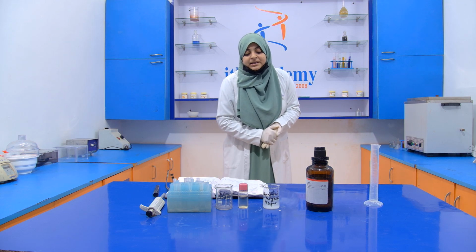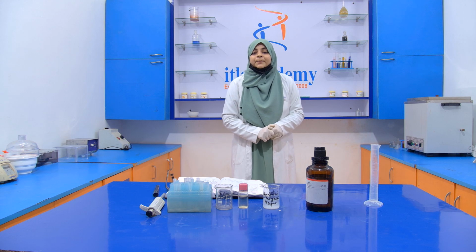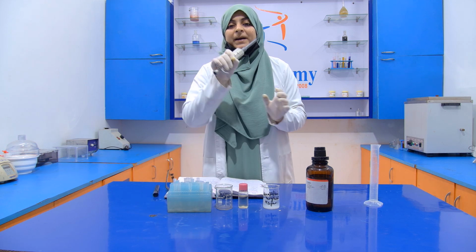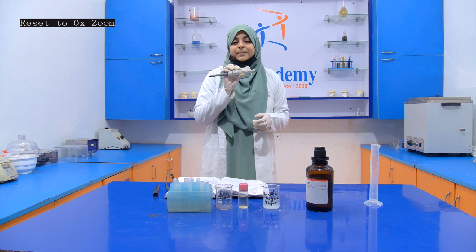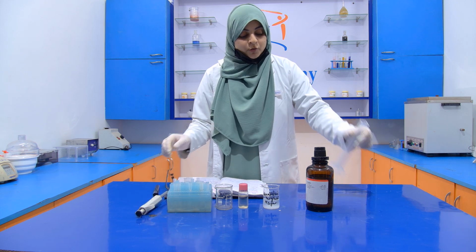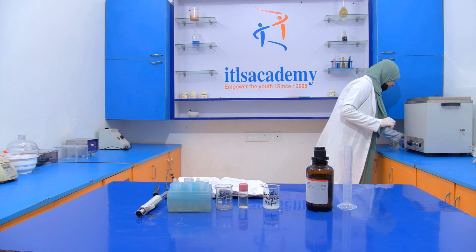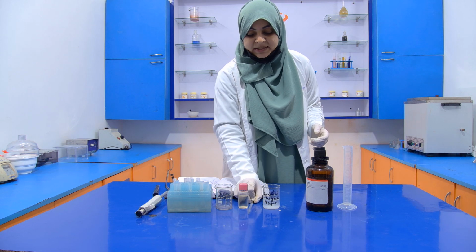Now for performing this experiment, we take out 1 ml of the oil, and this oil is taken with the help of a micropipette and micropipette tip. We have a 1000 microliter micropipette, that is 1 ml, and a micropipette tip, and we also have a measuring cylinder. One more thing that we require is a dropper. The dropper is also required for performing this experiment.